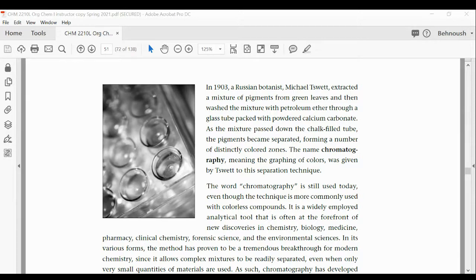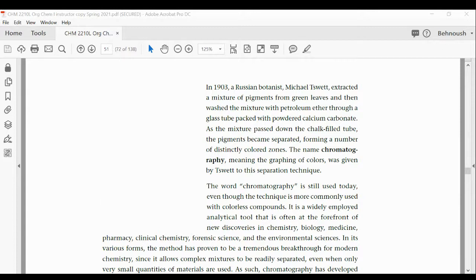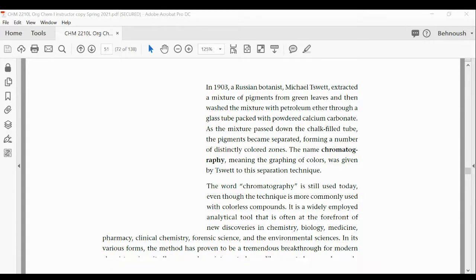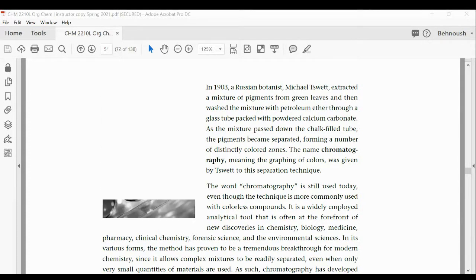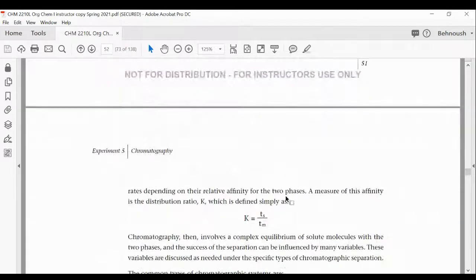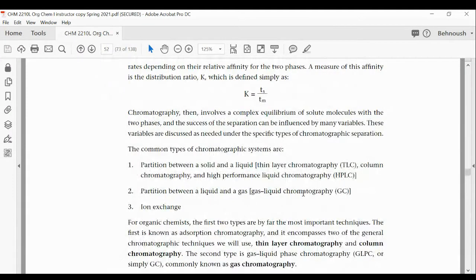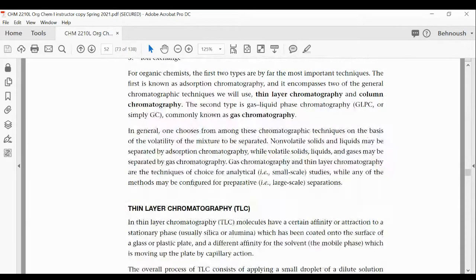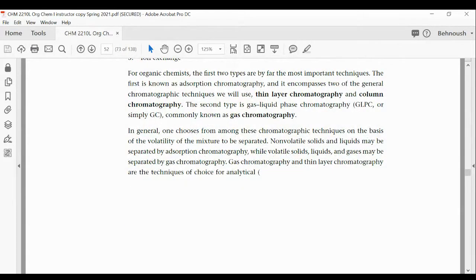So when you have a pool of two or three compounds, and you have your unknown, you are going to match the RF value of your unknown to each sample, and whichever is the same is going to be the identity of your compound. So the RF value of the unknown is compared to the RF values of known samples, or known possible samples that could be your unknown, and you can separate it, or you can identify it.